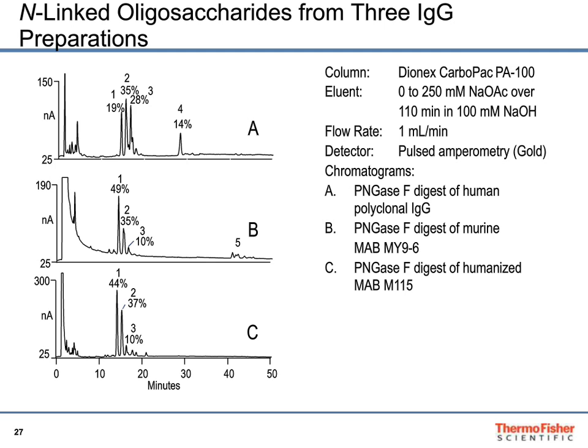So in this case, we see that in sample B, the murine has peaks that are labeled 5. It looked like they are highly sialylated, or maybe 2 sialic acids. The peak labeled 4 in the sample above is monosialylated. Well, it turns out because it's in mouse, it has more NGNA, or N-glycolylneuraminic acid, and that causes the elution to be a lot later. And we can see that when we treated the sample with neuraminidase to remove those peaks, and then we quantify the sialic acids that were released. So let's look a little bit at that.